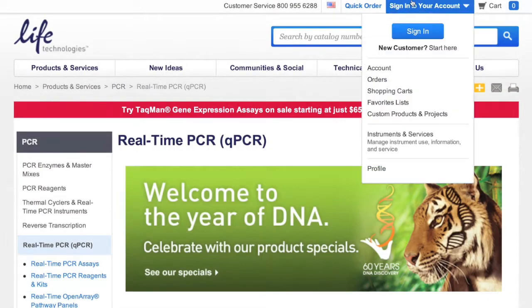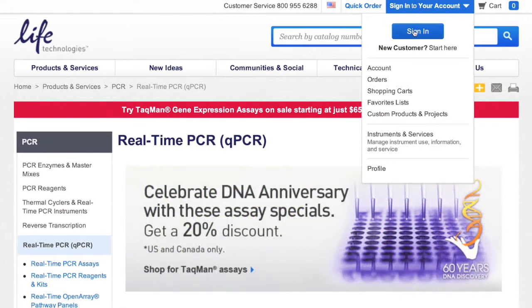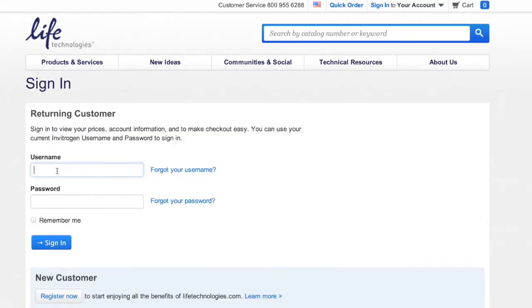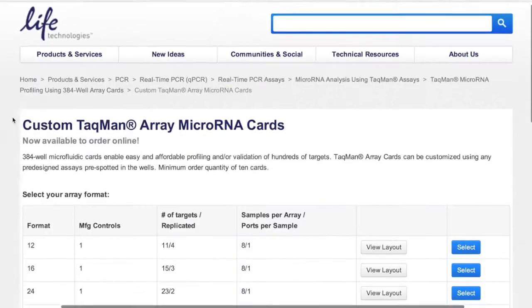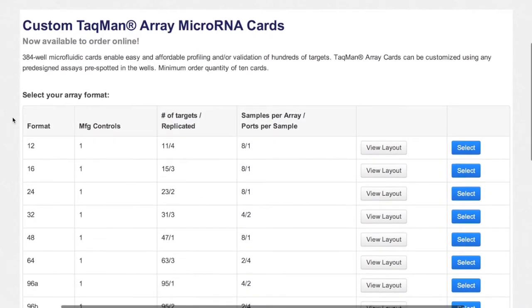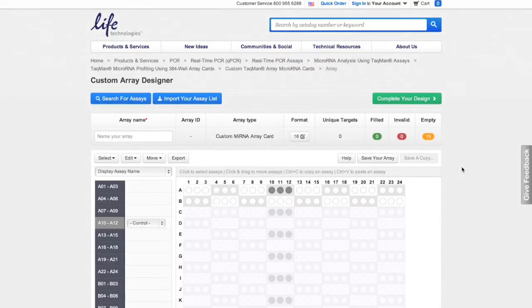Start by visiting lifetechnologies.com and log into your account, or create a new one if you don't already have one. If you know the number of microRNA targets of interest, you can select a specific format to meet those needs.